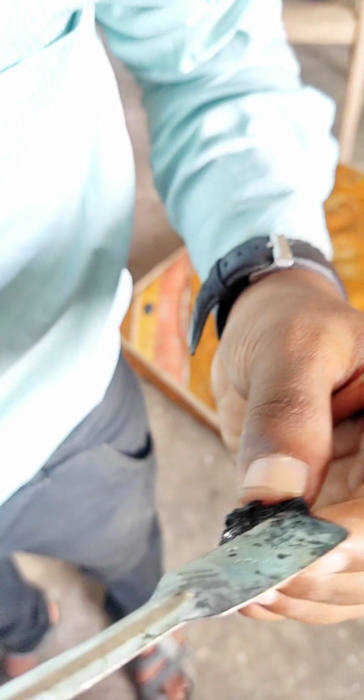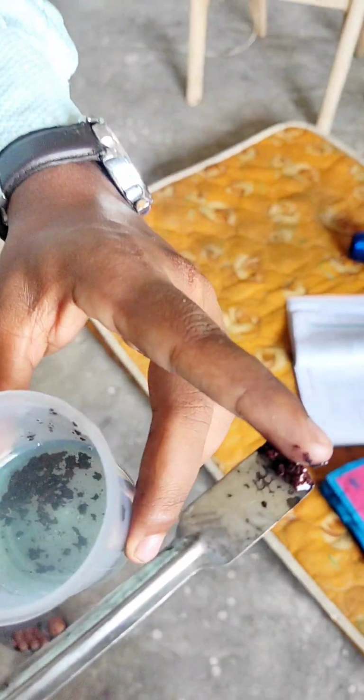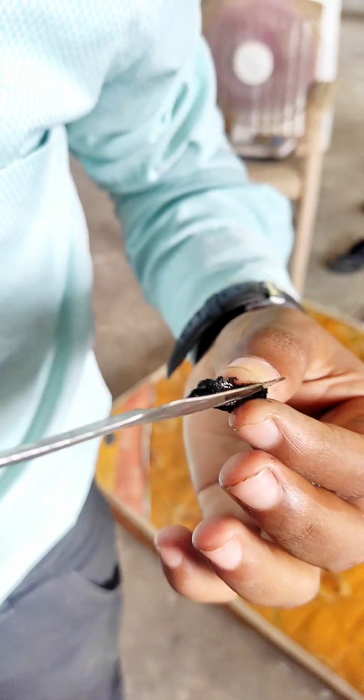it displaces the copper in copper sulphate solution and makes the solution zinc sulphate. Copper is displaced by zinc granules, zinc metal. So from this experiment we can see that zinc is more reactive than copper. So this is beaker B.